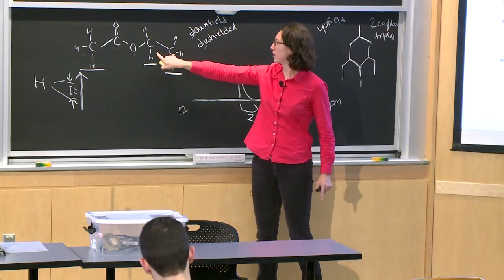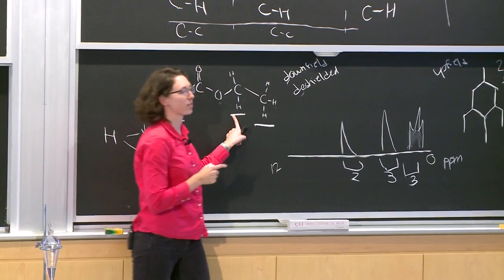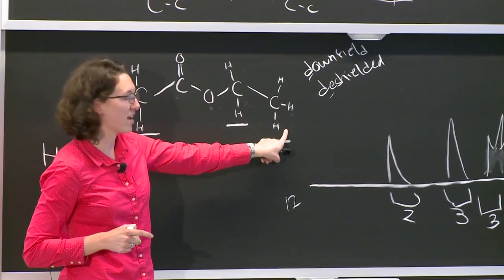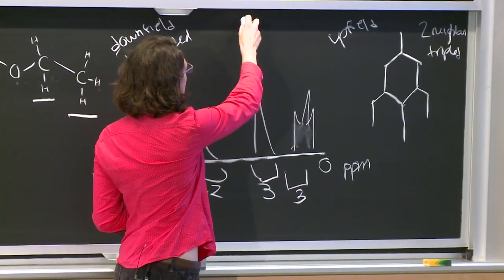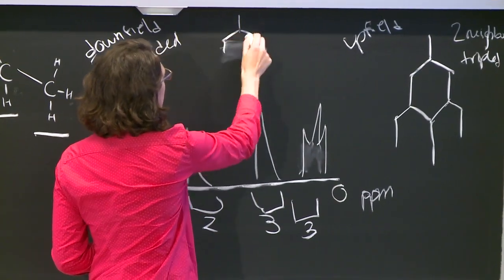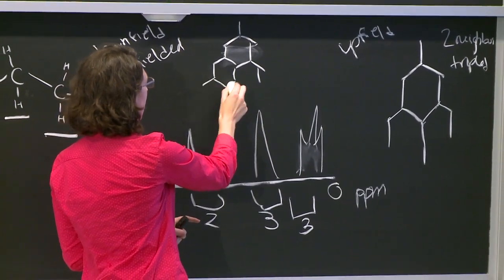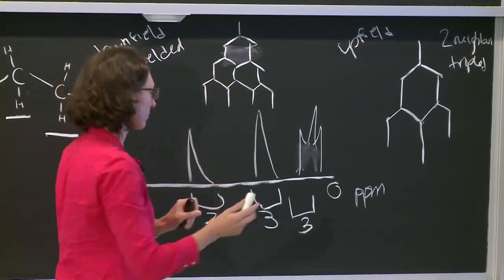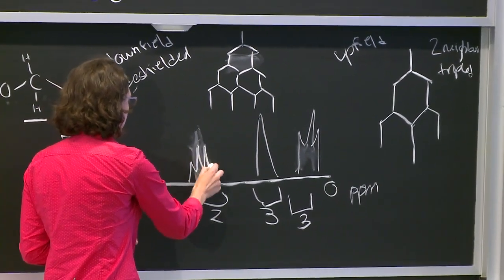What about our ethyl group here, or ethylene group, methylene group? We have our 2 protons. How many neighbors does this group have? Proton neighbors. So this has 3 neighbors. So that signal is going to get split 3 times. So you'll split it once. Oh, I can draw the lines. Split it again. So that would be our triplet. And then if we split it a 3rd time, we get 4 lines. So this proton signal will actually look something like that.